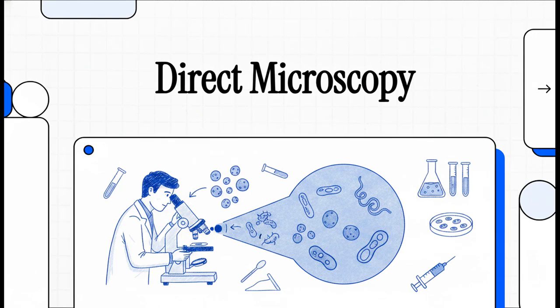Welcome to this explainer. Today, we're stepping into the really fascinating world of microscopic detective work. We're going to explore exactly how scientists and medical pros track down those tiny suspects to diagnose bacterial infections. So grab your lab coats because we're jumping right into the nuts and bolts of specimen selection and direct microscopy.